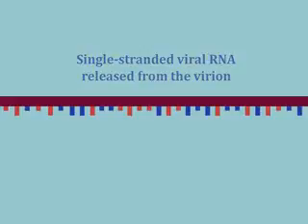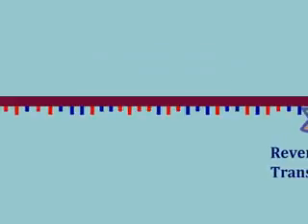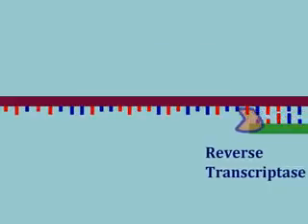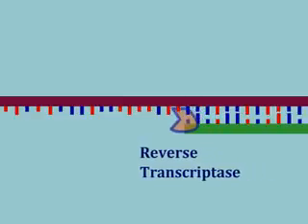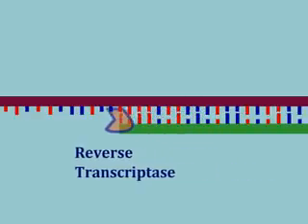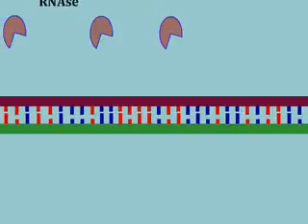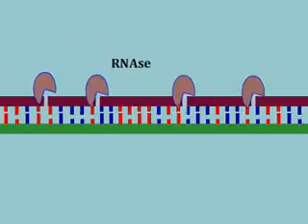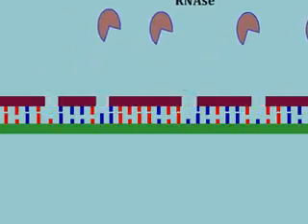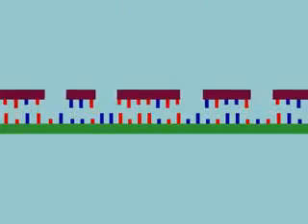Then, a complementary DNA strand is synthesized from the viral RNA using purified reverse transcriptase, just as it does in natural HIV replication. In some protocols, a specialized RNase is then added to nick the RNA and allow it to be degraded.